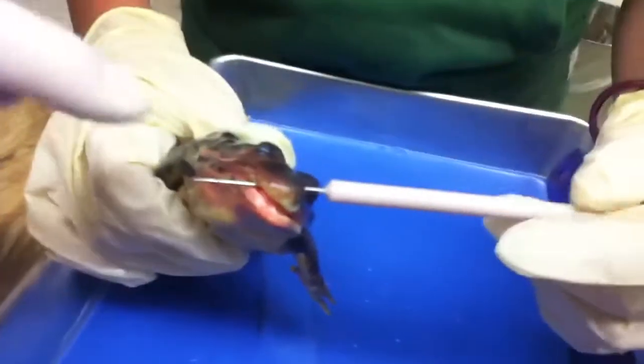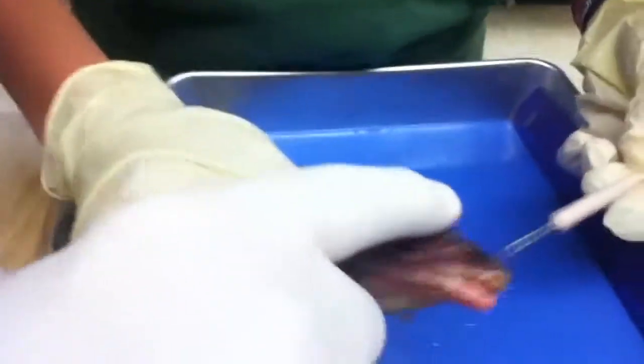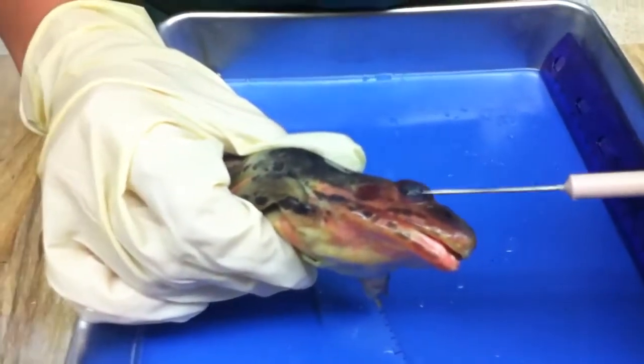Now, here is his ears, the tympanum. Yeah. The eye with the nictating membrane, and you can hopefully move it up. Maybe not. Okay. But I want to show you that.